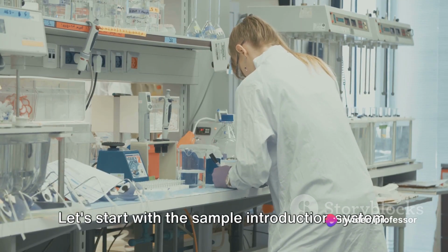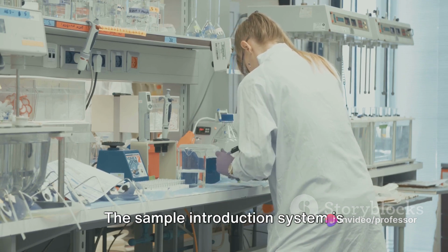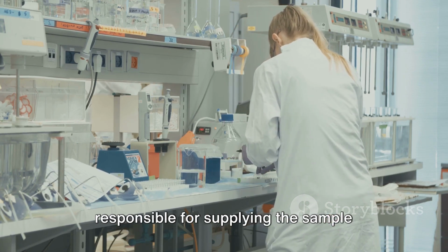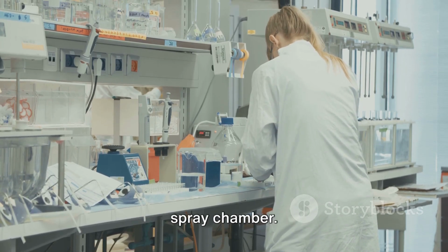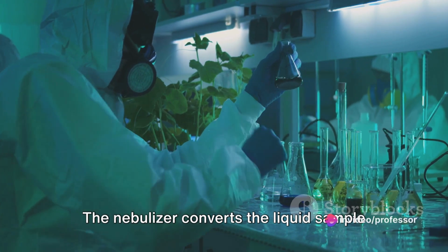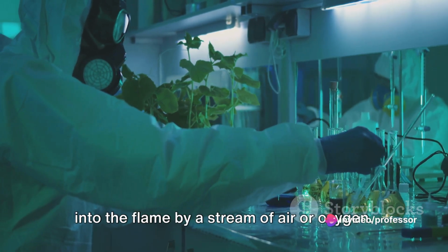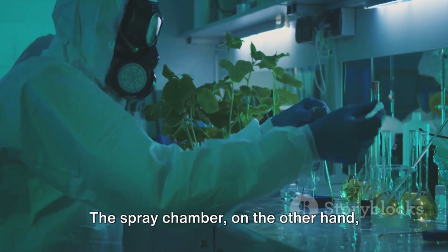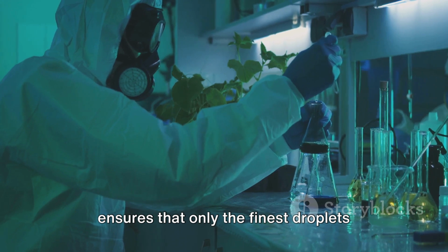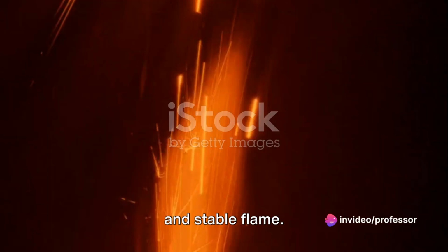Let's start with the sample introduction system. This is where our journey begins. The sample introduction system is responsible for supplying the sample solution to the flame. It usually includes a nebulizer and a spray chamber. The nebulizer converts the liquid sample into an aerosol, which is then carried into the flame by a stream of air or oxygen. The spray chamber, on the other hand, ensures that only the finest droplets reach the flame, contributing to a uniform and stable flame.